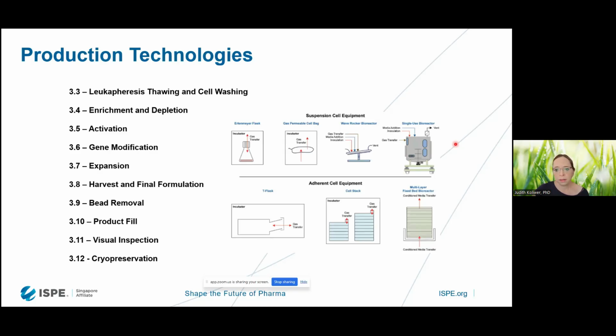So I think that's one of the examples where maybe we as an industry are not considering something strongly enough, and then we realize, oh, that really makes a huge difference. And in their publication, they suggested that it might be hypoxic conditions that are introduced by the bioreactor. So that's something where we felt it's really important that we put emphasis on this, because it really makes a huge difference when it comes to using our process.